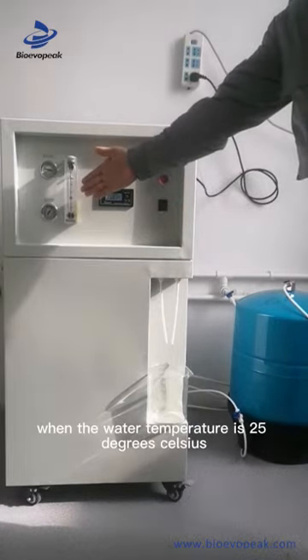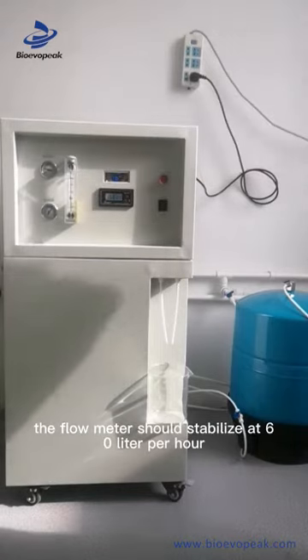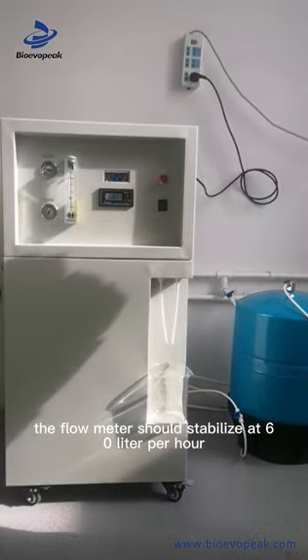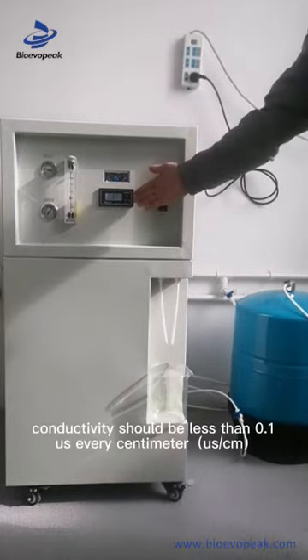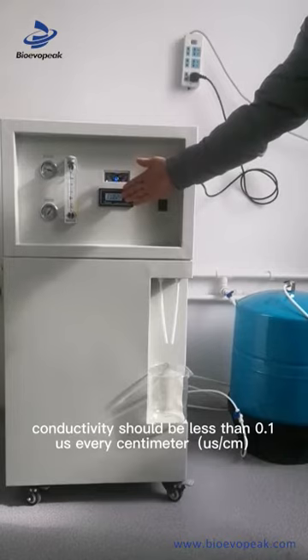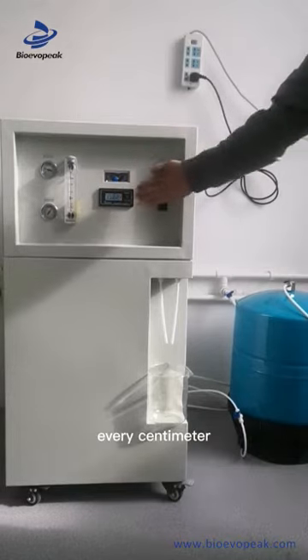When the water temperature is 25 degrees Celsius, the flow meter should stabilize at 60 liters per hour. Conductivity should be less than 0.1 µS per centimeter.